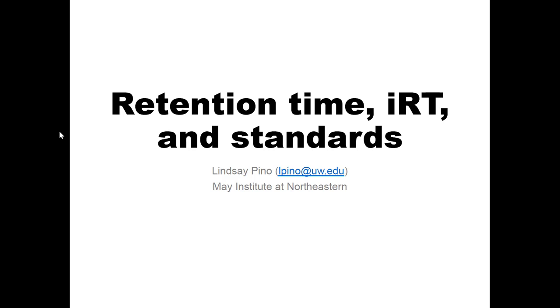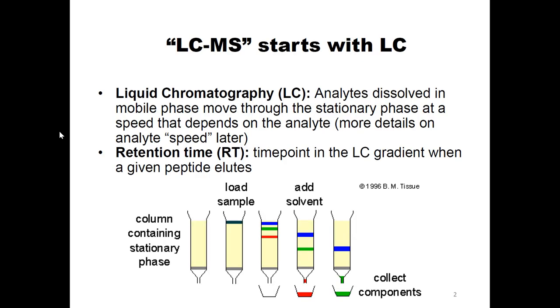We're going to be talking about retention time, IRT, and standards, which we've already kind of mentioned a couple times here, but I just want to emphasize a couple definitions in case you might be new to mass spectrometry, or maybe you work with the data but might not realize that in front of the mass spectrometer sits a liquid chromatography system. So the liquid chromatography, all of our peptides or our small molecules that are dissolved in some solvent are separated out by liquid chromatography. And the time at which they come off the column in front of the mass spectrometer is the retention time.